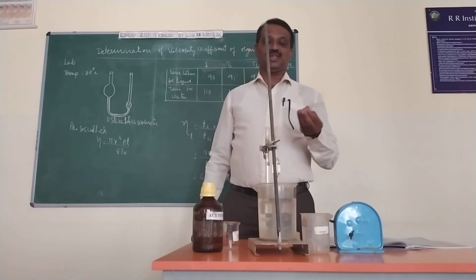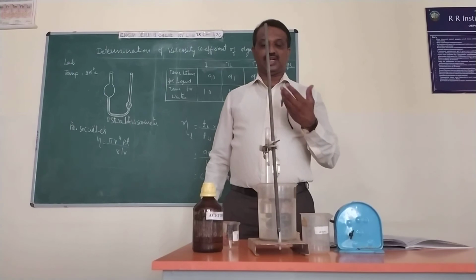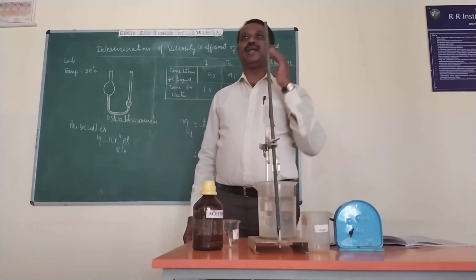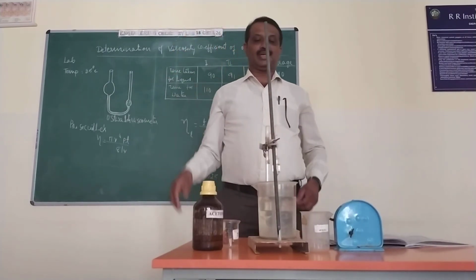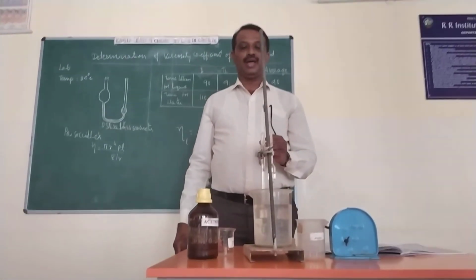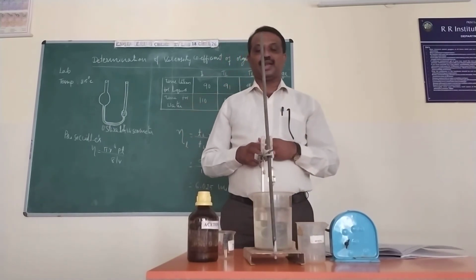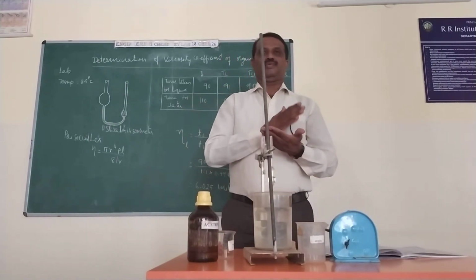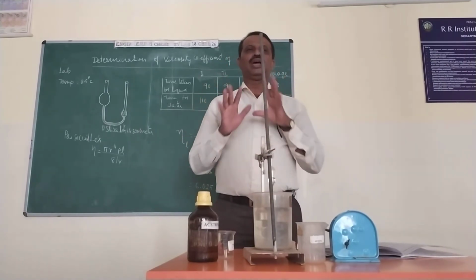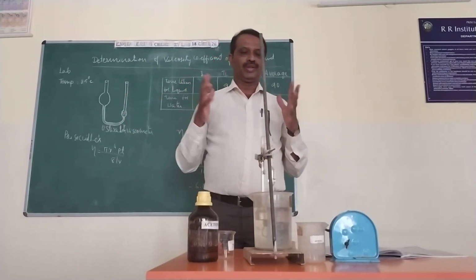Any variation in the liquid movement time can come from temperature. If the temperature increases, the movement time is less and the speed is more, so time is inversely proportional to temperature. Suppose you take any other organic liquid: the viscosity coefficients of all organic liquids are very, very different. They do not match one another.